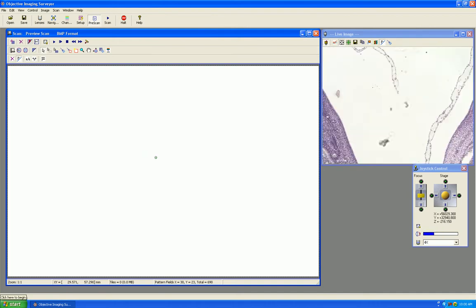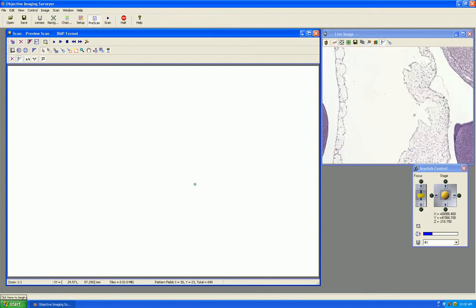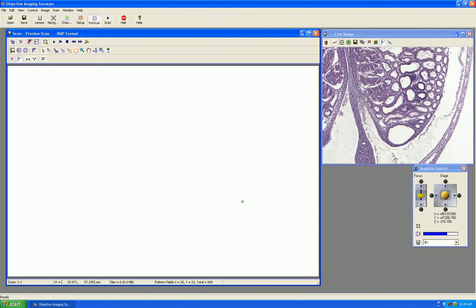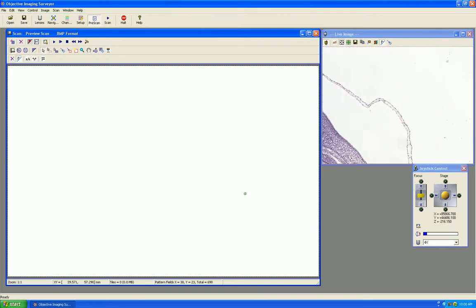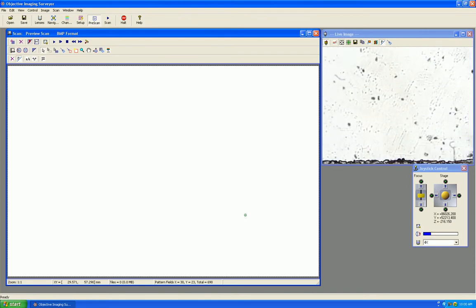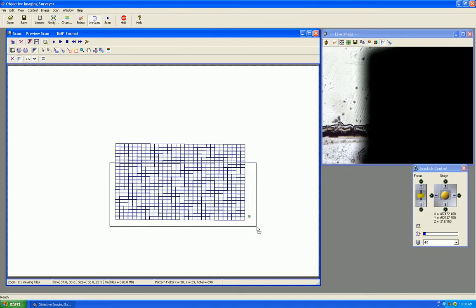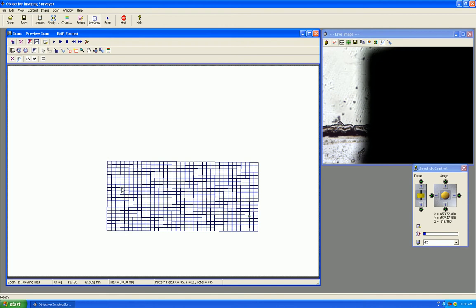Then I'm going to drive to the upper left corner of the slide. Which is here. So somewhere in this area, when I'm selecting pre-scan, I want to find out, I'll draw that a little bit bigger. I'm going to do that again.